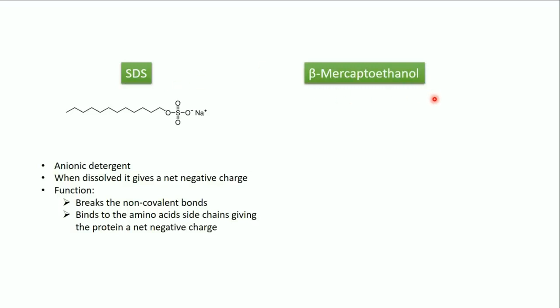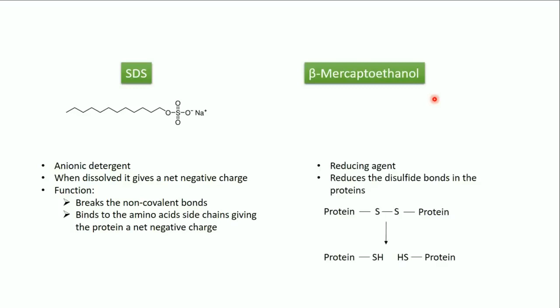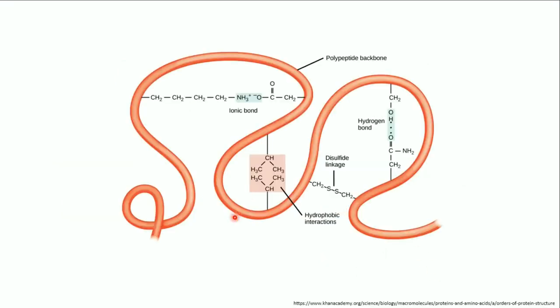Similarly, beta-mercaptoethanol also has a role in the denaturation of the protein. It's a reducing agent. It reduces the disulfide bonds in the protein, so it separates the subunits of a certain protein. So this is the protein, this is the amino acid or the peptide chain of the protein, and then the secondary, tertiary and quaternary structures are formed by non-covalent bonds like the ionic bond, the hydrophobic interaction like van der Waals bonds, the hydrogen bonds, and the disulfide linkage. And these bonds are broken by the SDS and the beta-mercaptoethanol. At the end, we will have the protein as a peptide chain.